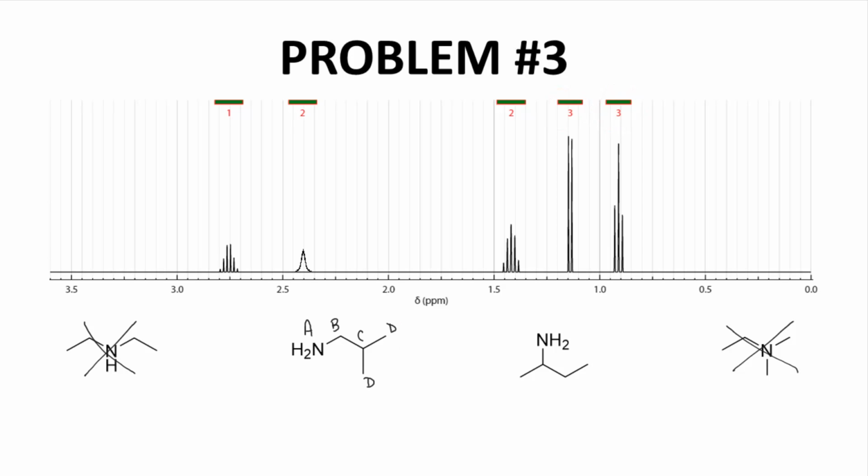We see distinctly 2 methyl groups. So before we eliminate that structure, let's go to the other one and make sure that the other one is going to give us these multiple methyl groups. So let's go over here. Let's just label these A, B, C, D. The NH2 is E. So if we're correct, this is almost certainly going to be signal E. That's our NH2. Now, we do have 2 methyl groups. These don't look identical, or we wouldn't predict they'd be identical by symmetry. So seeing 2 different ones is completely reasonable.